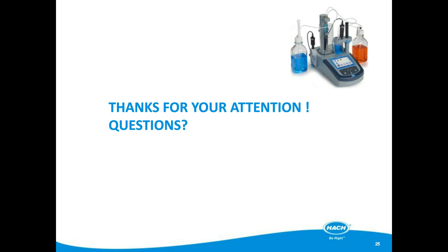I hope everyone did find the questions. I have another one for you, Philippe. Another question is coming in, and it is, what is the maintenance of an automatic titrator?